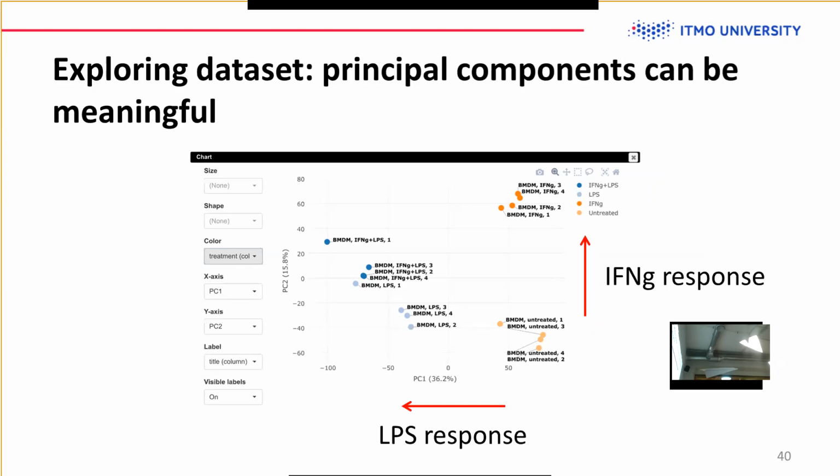And there can be different ways to do this. How is it called?